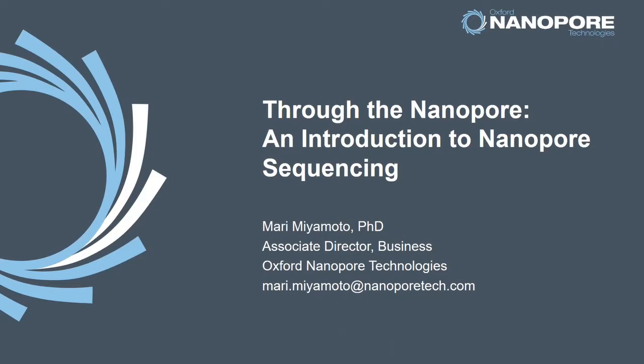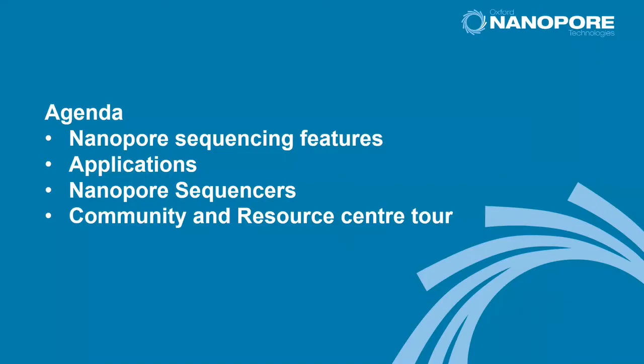So today's talk is because we are running a workshop. It's a brief overview again of the nanopore sequencing features and applications, and what nanopore sequencers we have. We also have a lot of information, training content, and videos on the community side, and also the publication resource center. But because we update information quite often, people sometimes get lost, overwhelmed by so much information. So I'm going to go through the community, where you should look, where the useful information is, and how to find it. I will show that information as well as the applications.